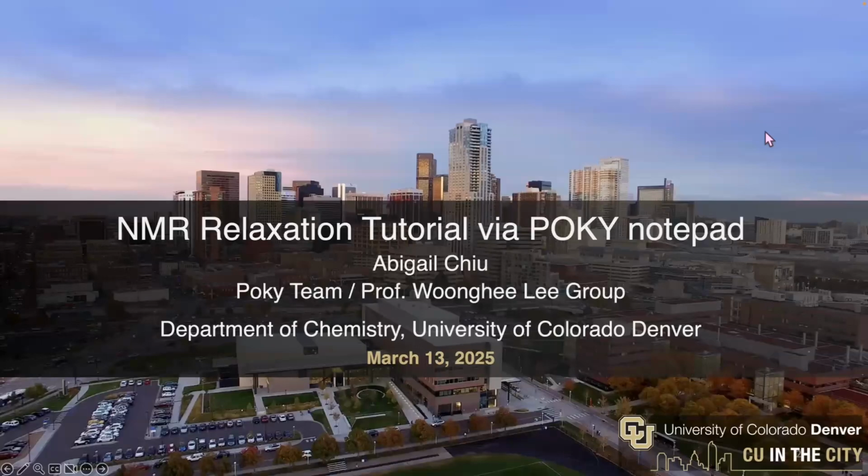Hi, my name is Abigail Chiu, and welcome to this tutorial on performing NMR relaxation via POKY Notepad scripts. These POKY Notepad scripts will give similar results to the RH and NP dialogues, but with additional useful features. It is also useful for users who want to do scripting to make their own edits.